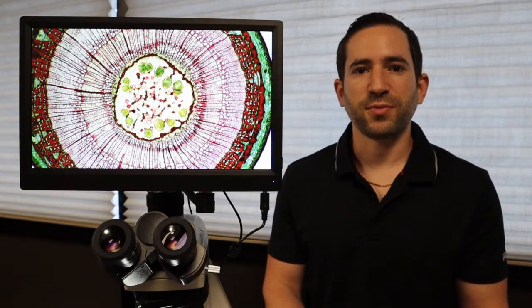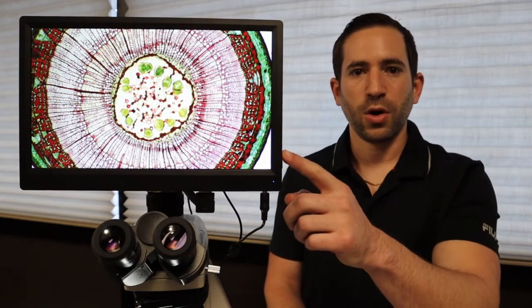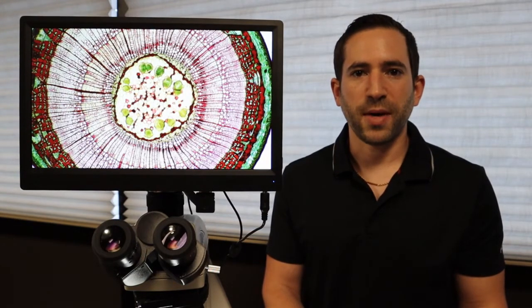There are numerous options when it comes to an LCD screen for your microscope. You could have a mouse-controlled LCD screen which is shown here or a tablet touchscreen LCD screen. We suggest a mouse-controlled rather than touching and leaving your fingerprints behind and it's also more responsive when using a mouse.